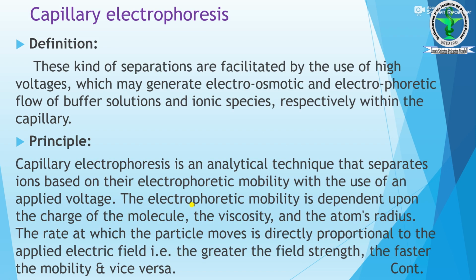Okay. So in the case of the definition of capillary electrophoresis, this kind of separation is facilitated by the use of high voltage. We use high voltage here, which generates electroosmotic and electrophoretic flow.